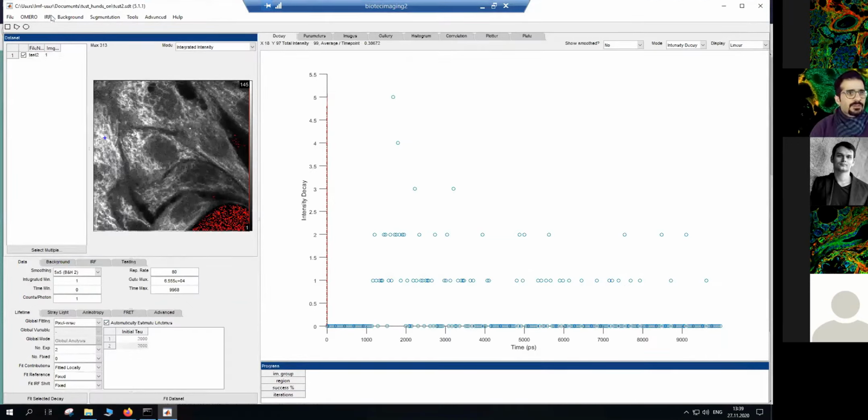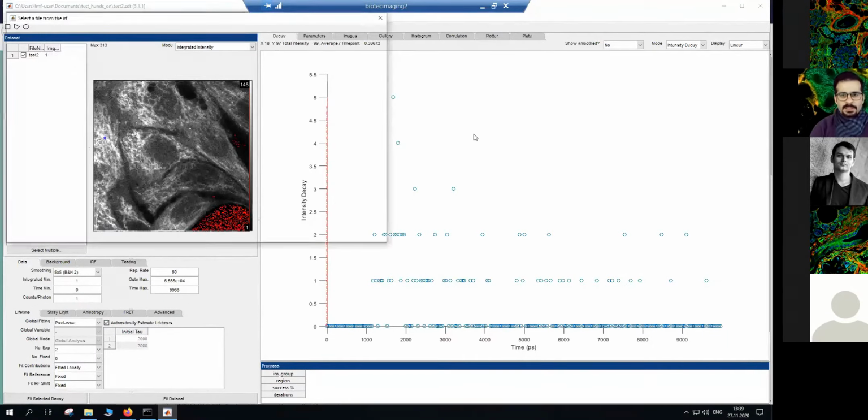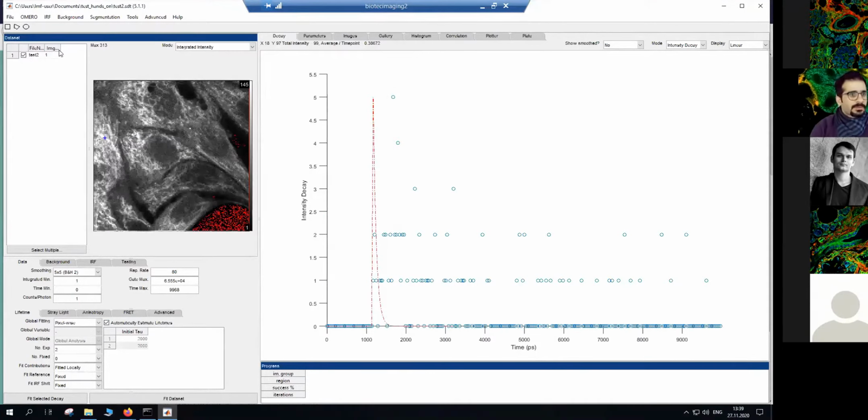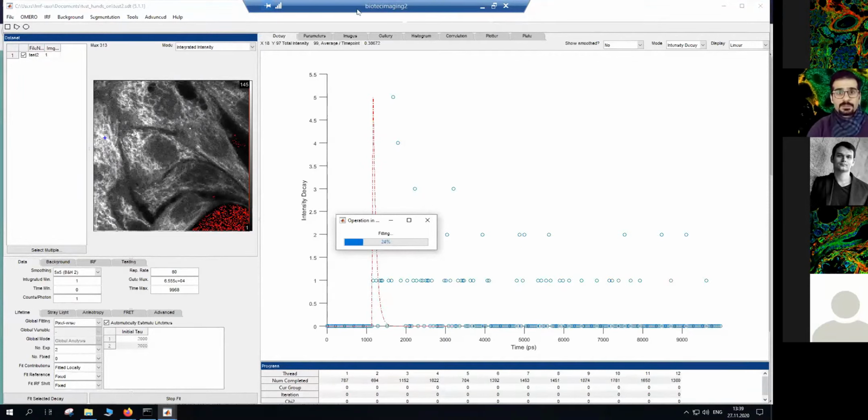And if I just load this IRF and go into the IRF, so it's loading that here. So this is the dirty fitting. I just want to have some images to look at the other parts. This is not going to give me really good fits. There are so many other things in between that have to be taken care of.